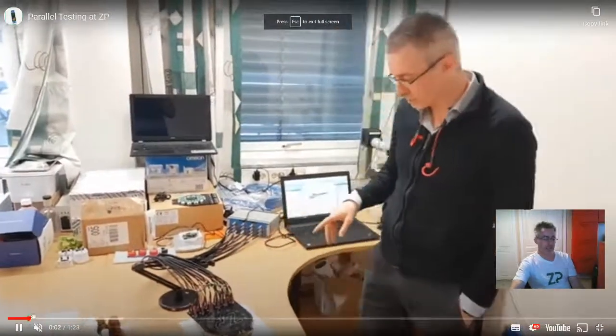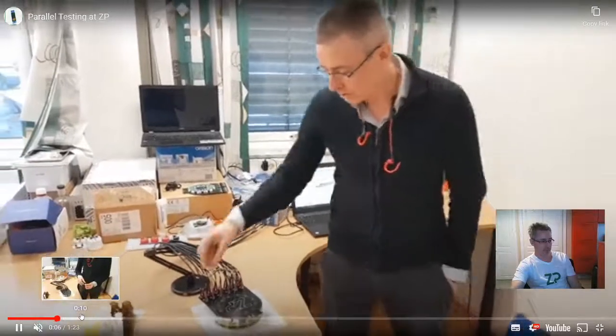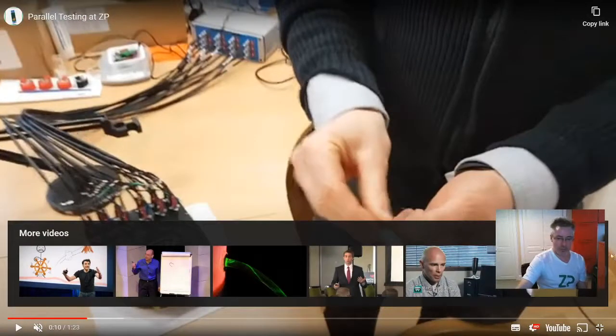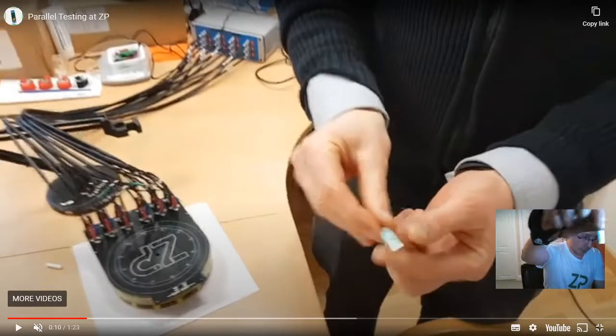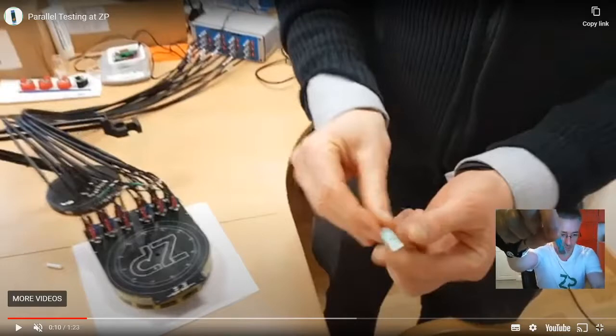At ZP we do have off-the-shelf test rigs that you can use for parallel testing. In a minute I'm going to zoom in on this video and show you that these test rigs can come where the electrodes actually go into the solution in a horizontal fashion.